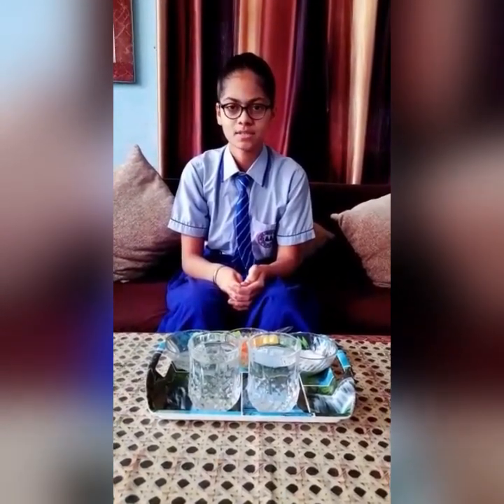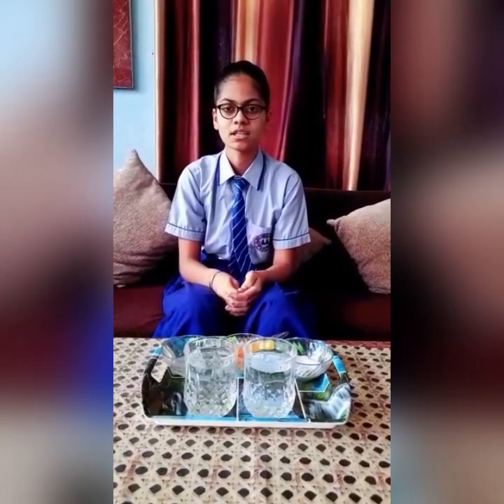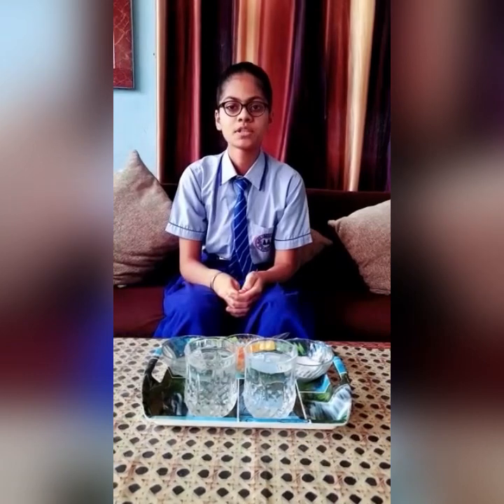Myself Sikmulpik, student of 10th C. I am going to present an acid and base experiment. In this experiment, we will demonstrate whether a particular substance is acidic or basic in nature using turmeric powder, which acts as a natural indicator. Indicators are chemical substances that tell whether a particular substance is acidic or basic in nature.